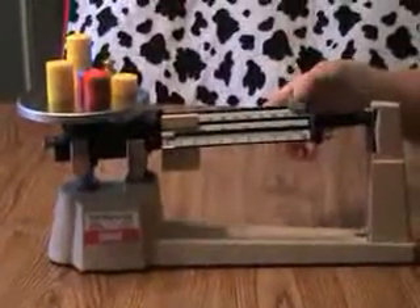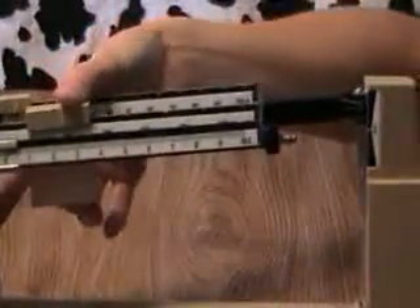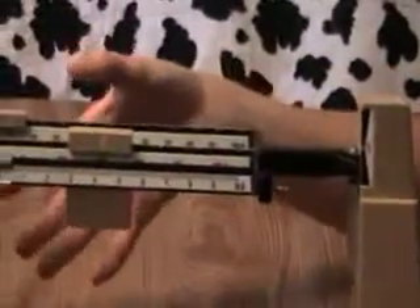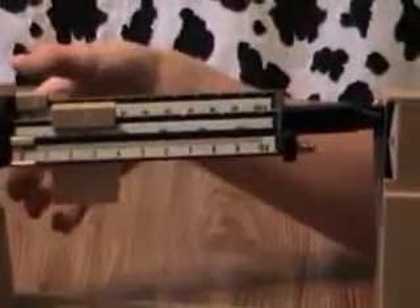Nope. Hundred. Nope. Okay, so this time we get to use the middle beam. I'm going to try one hundred — make sure it's in the grooves. It's still too light. Two hundred. Too heavy. So I'm going to go back to one hundred. Now I'm going to move the tens.